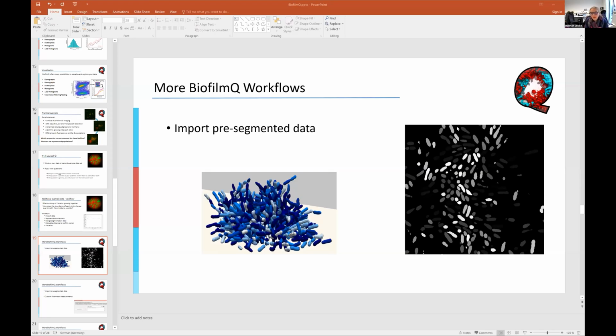Okay. So if I understand correctly, and Hannah, correct me, please. The cube segmentation method is just creating something like this label map, just on the basis of cubes and the thresholding. Yeah, that is true. And actually, now I'm just quickly sharing here. So this is a slide that would have come up in an hour roughly.